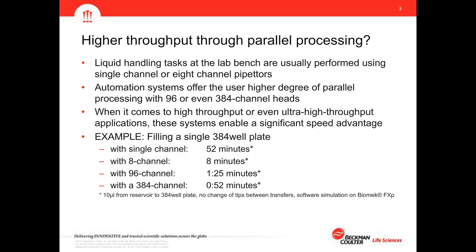I'm just giving you a very simple example down here, which is filling a 384 well plate with 10 microliters of a buffer from a reservoir, which takes, using a single channel, approximately 52 minutes, while using an 8-channel, you're already down to 8 minutes. If you use a 96-channel, you're down to a good 1 minute, and with a 384 channel, it's below 1 minute.